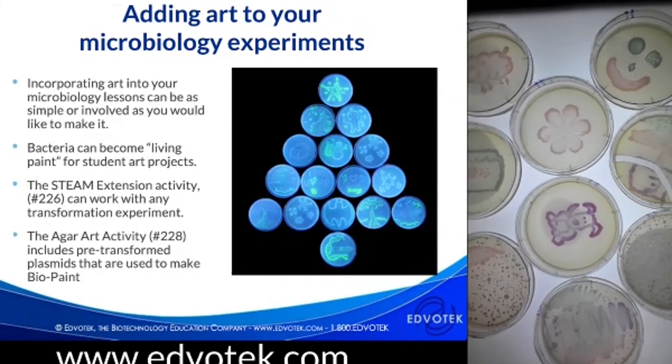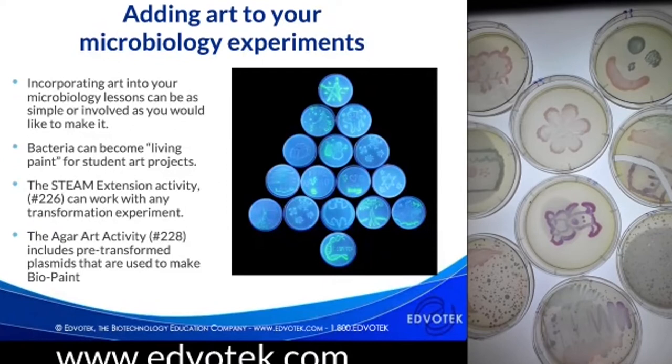And so just to wrap up for now, incorporating art or design into your microbiology experiments can be as simple or as involved as you would like to make it. While I've been demoing this with our Edvotek resources, these steps are going to be applicable to any transformed bacteria that you would use. So if you had a chromogenic or fluorogenic protein under an expressible promoter, give it a try and see how well it works for you.